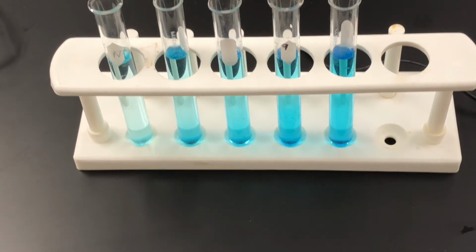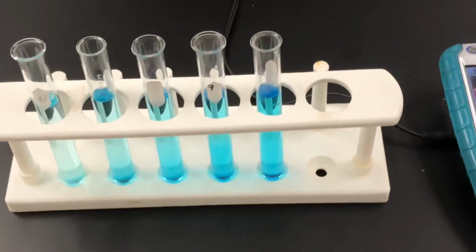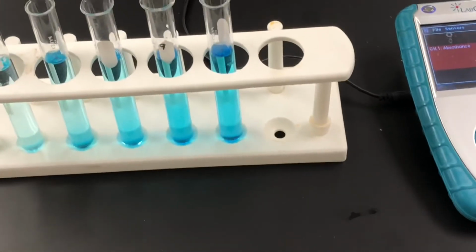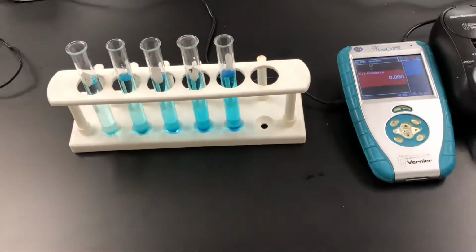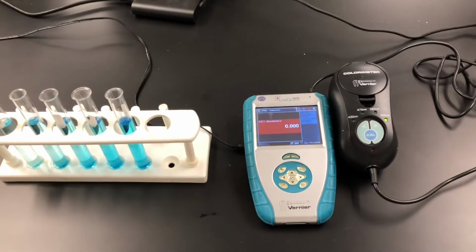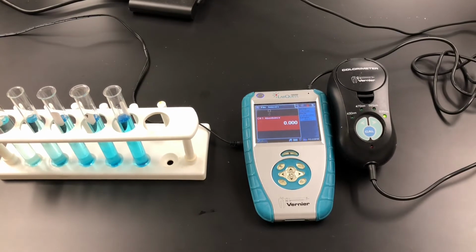Now what we want to do is get a sample of each one of these, and we want to read what the absorbance would be for each test tube, and we're going to plot that. So let's go ahead and get that cuvette out.